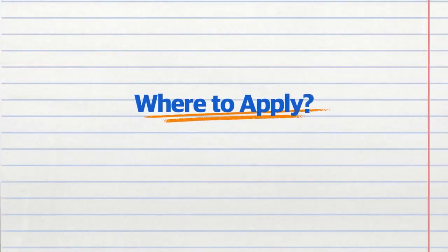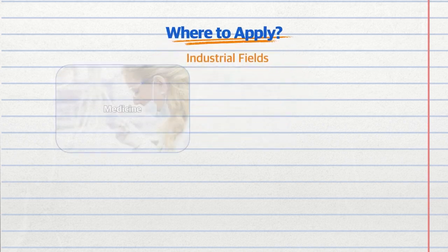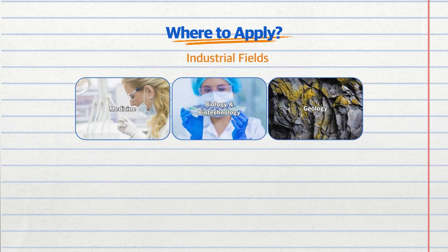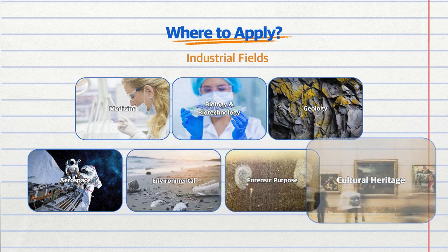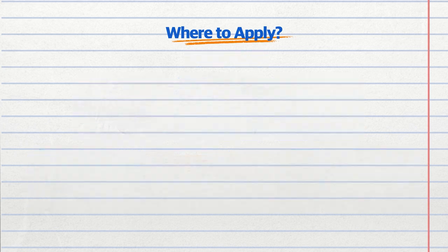Pyrolysis GC-MS can be applied to the research and development of new materials, quality control, characterization, etc. The industry fields that apply this technique are numerous, such as product evaluation, medicine, biology and biotechnology, geology, aerospace, and environmental analysis, to forensic purposes or conservation and restoration of cultural heritage.